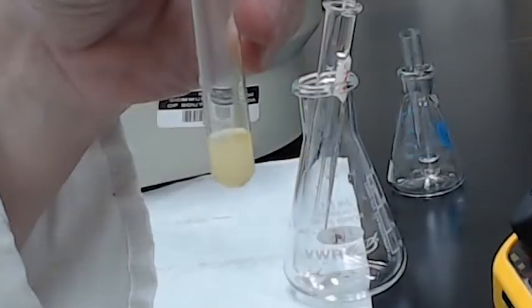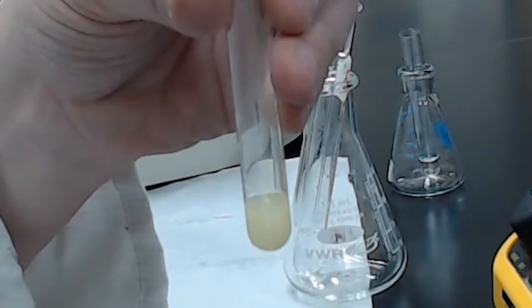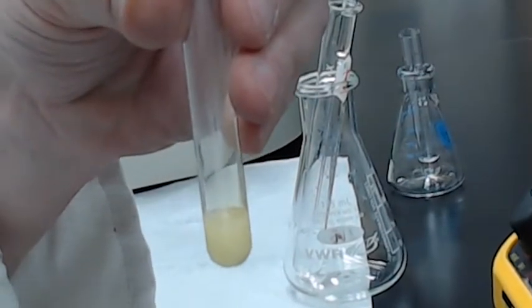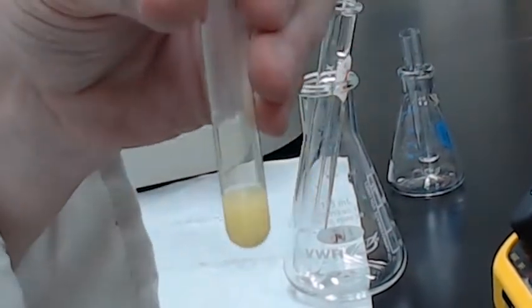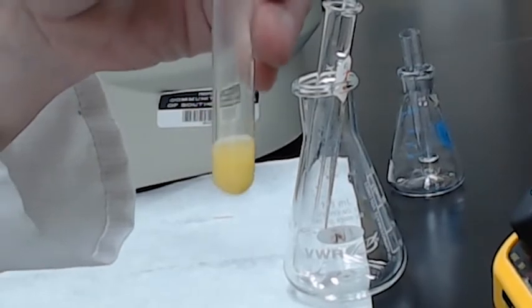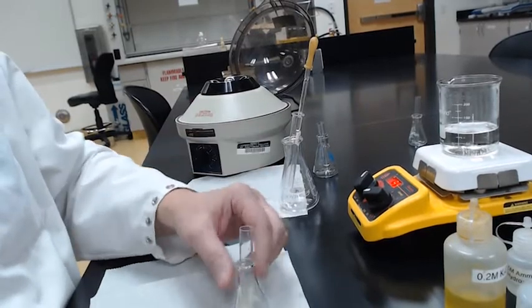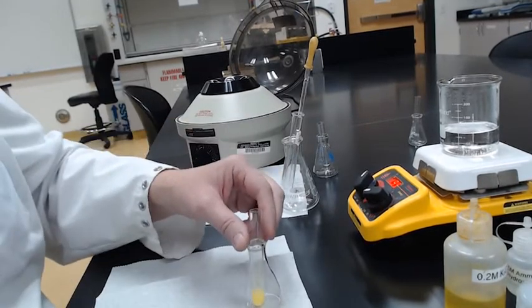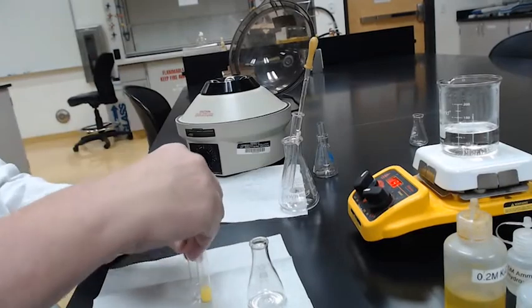And what do we see? Well, since I see cloudiness, I need to continue. And we're going to continue by trying to make it until the yellowish solid is complete. I've done 2 drops, 3 drops, maybe 1 more drop should do it. Yep, that looks like it stayed about the same. The liquid just became more yellow. Okay, so we will suspect that we now have some barium in there. We're going to do a confirmation test, and to do that we're going to have to centrifuge and redissolve. So where's my centrifuging balancing tube? Oh, they look pretty close.